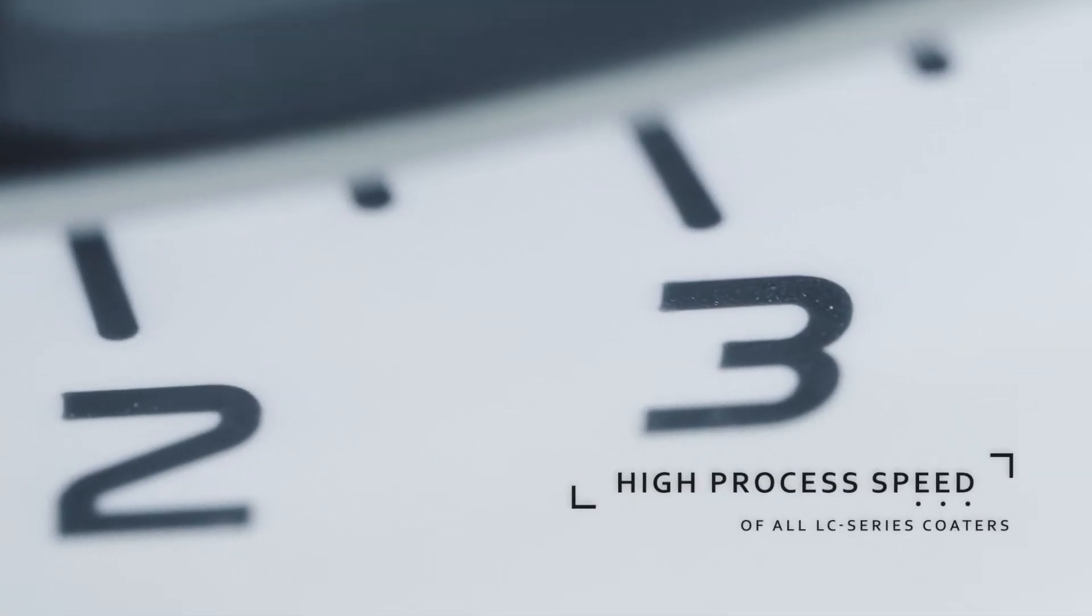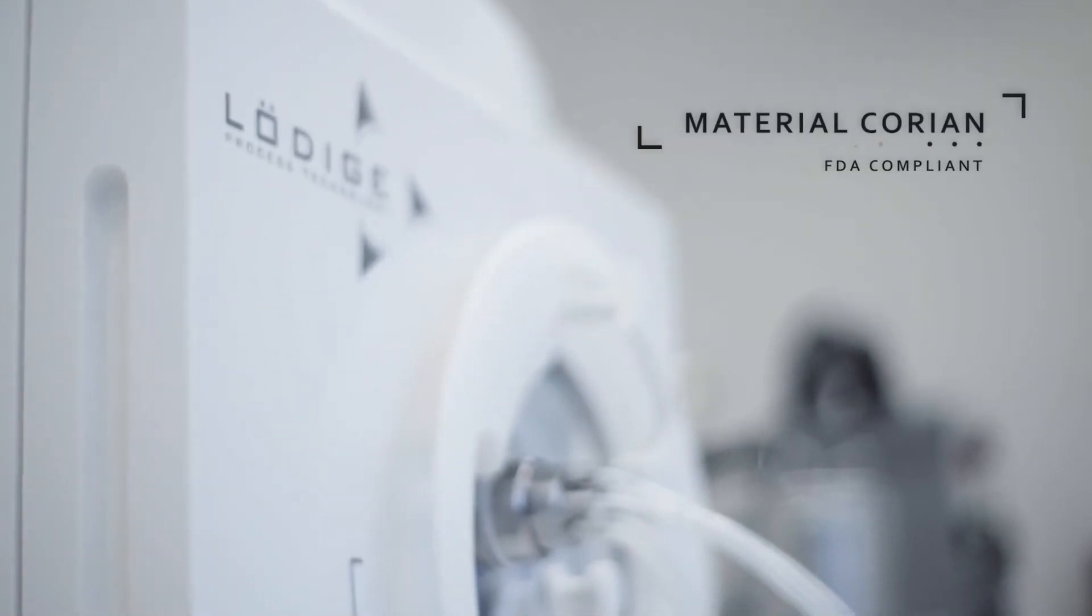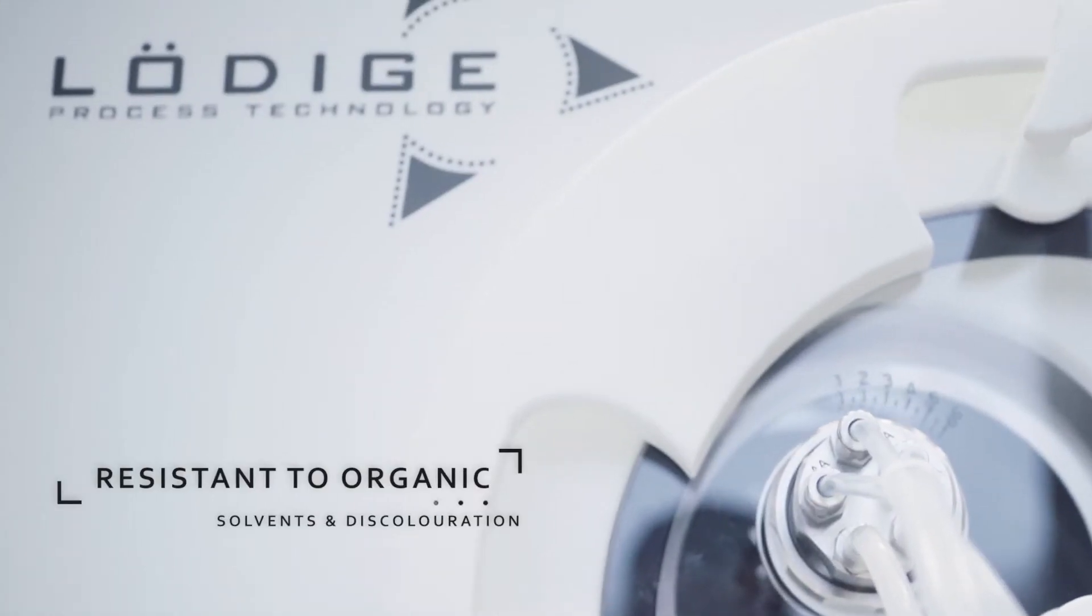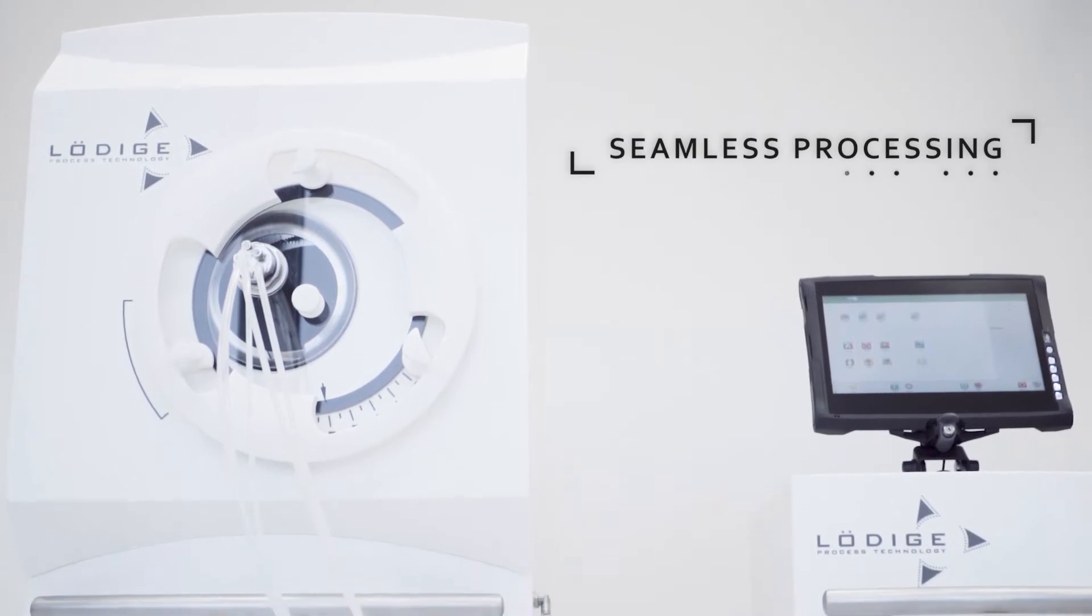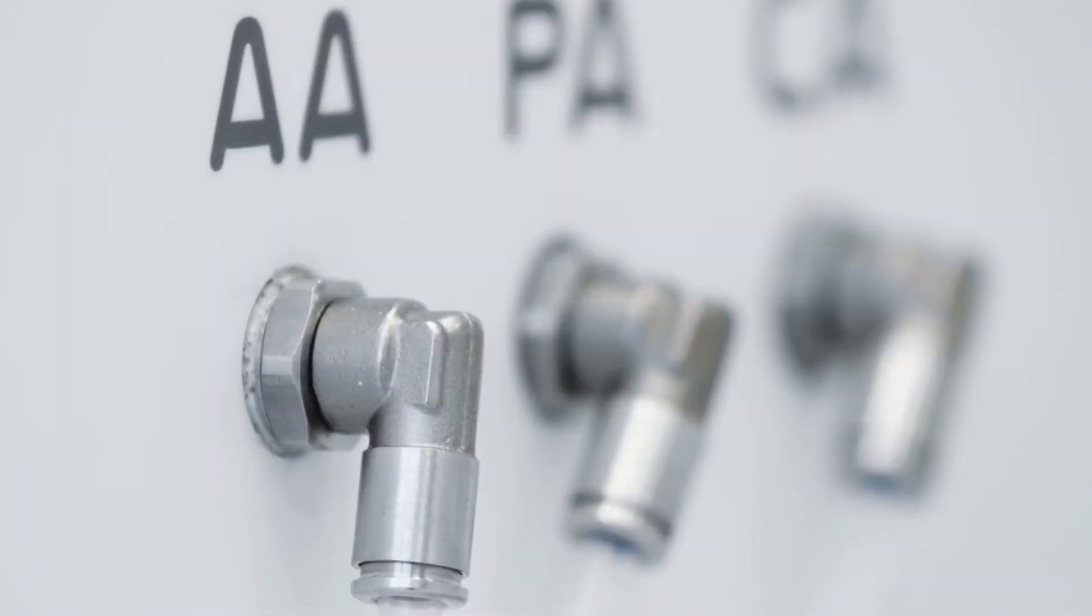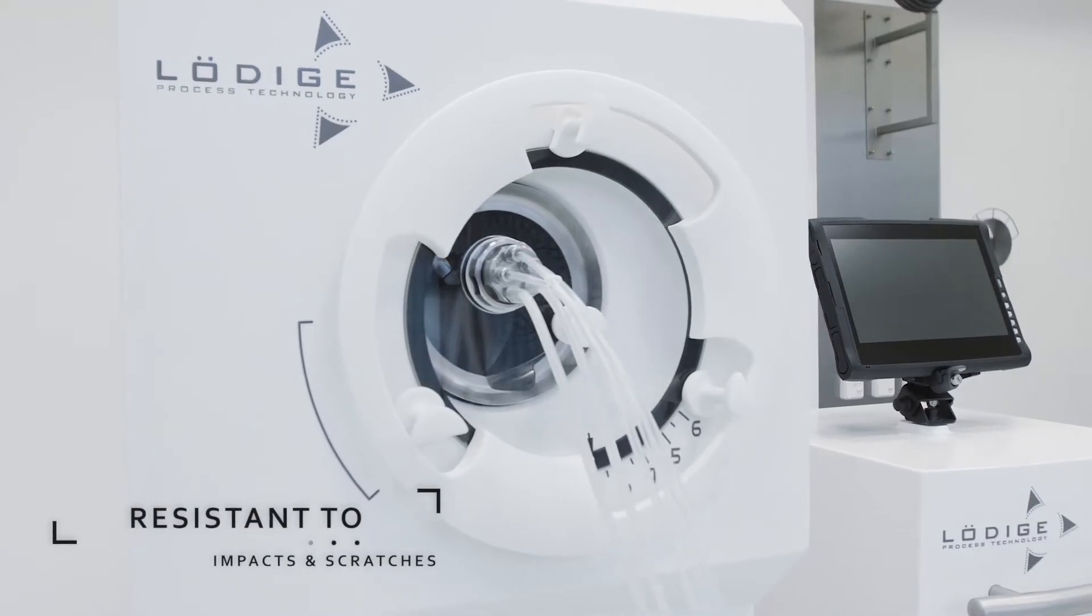This lab coder combines a modern design with great functionality. This starts with the selection of Corian as an exterior material. Corian is a highly resistant and durable material, which is now being used for the first time in pharmaceutical machine applications on this machine.